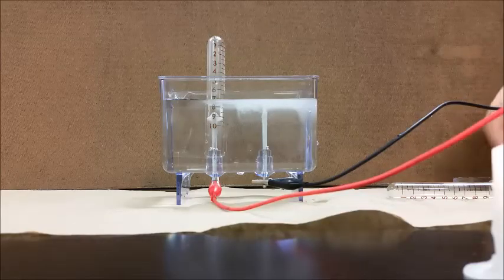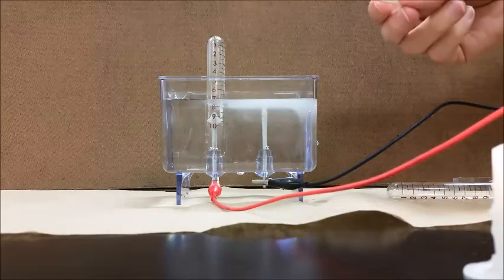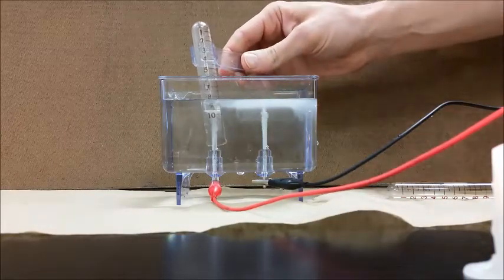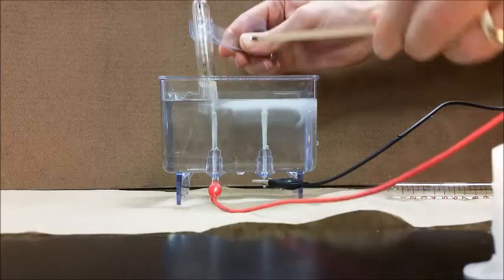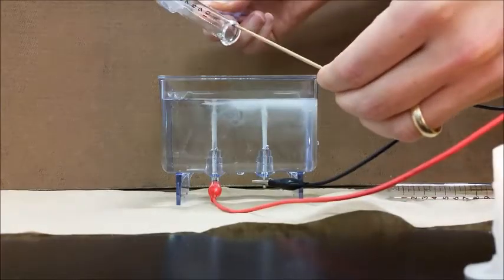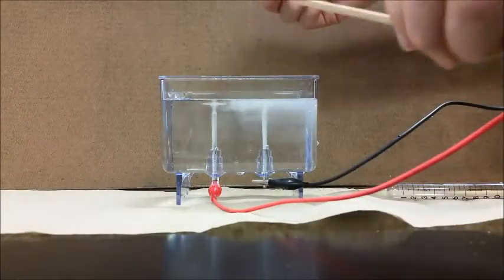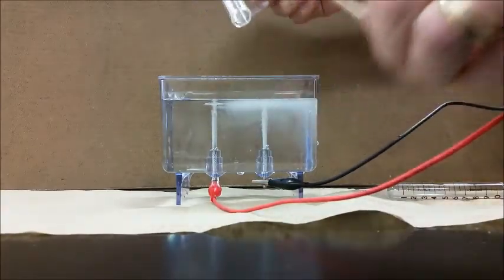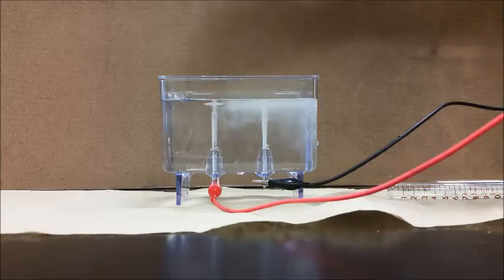We're now at a point where we can go ahead and test the second tube. I'm going to take a splint, ignite it, put it out, and use the glowing splint to test this tube. The glowing splint reignites in there, which indicates that there's oxygen present inside that tube. So what we're showing is that we have two times as much hydrogen gas being produced as oxygen gas.